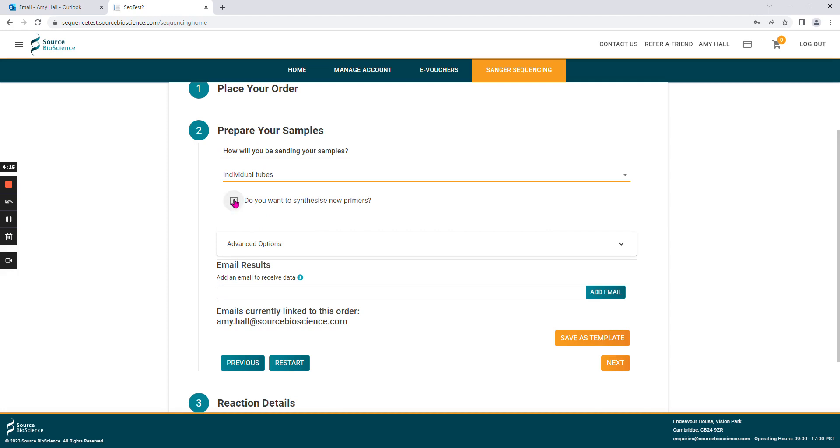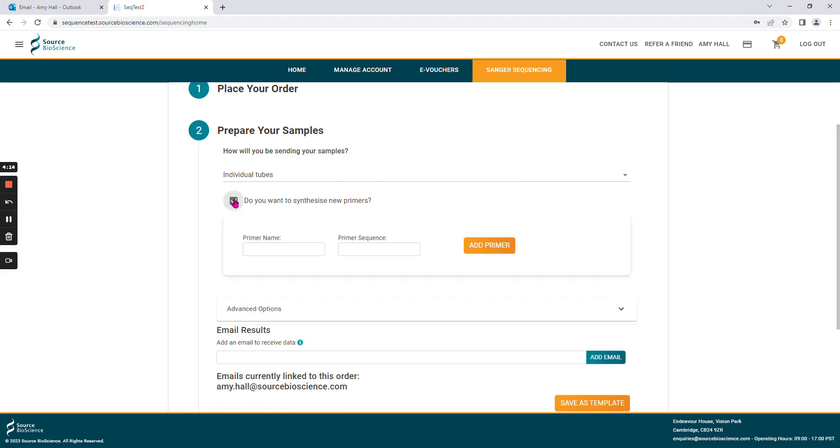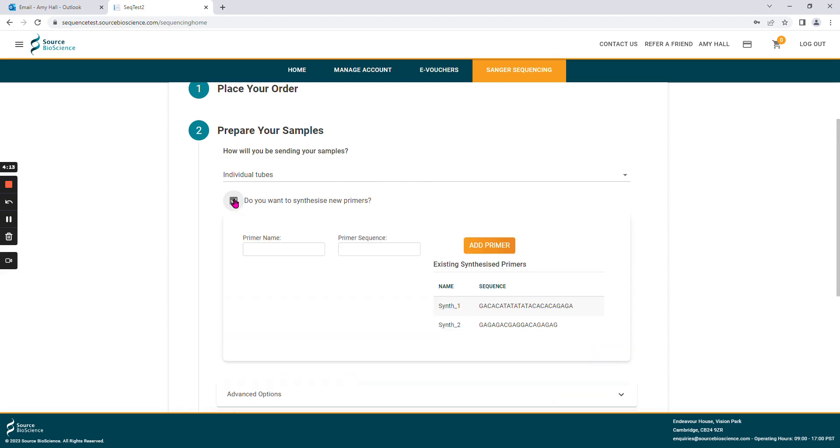You can also choose to add synthesized primers to your order. Type in their primer name and the primer sequence and select add. This will save these primers to your account and give you a list of the primers you already have available to you. If you don't wish to use synthesized primers, please unselect this box.